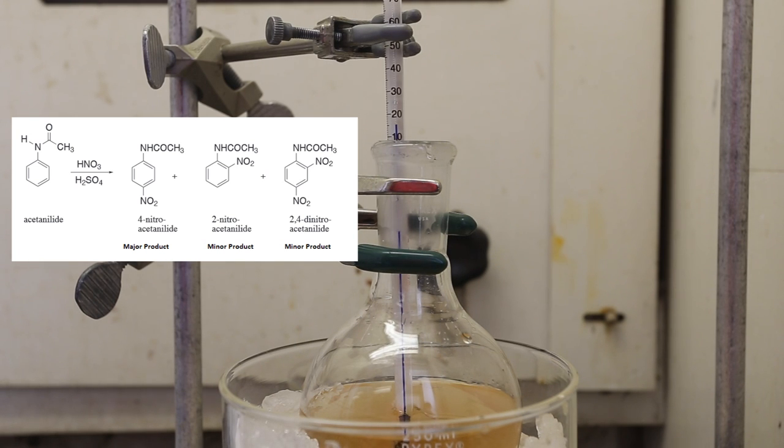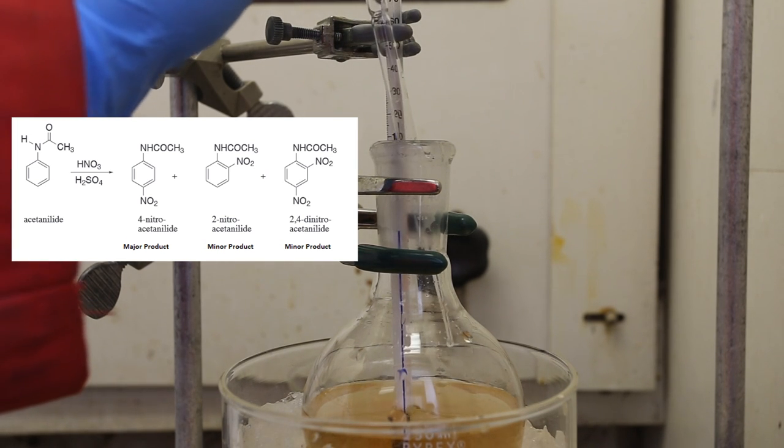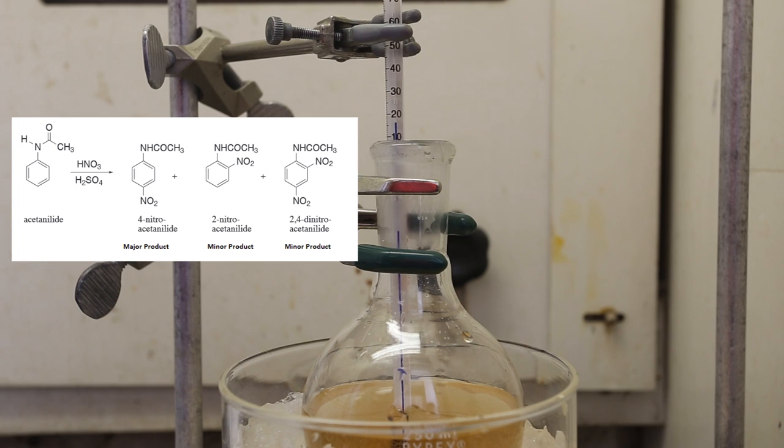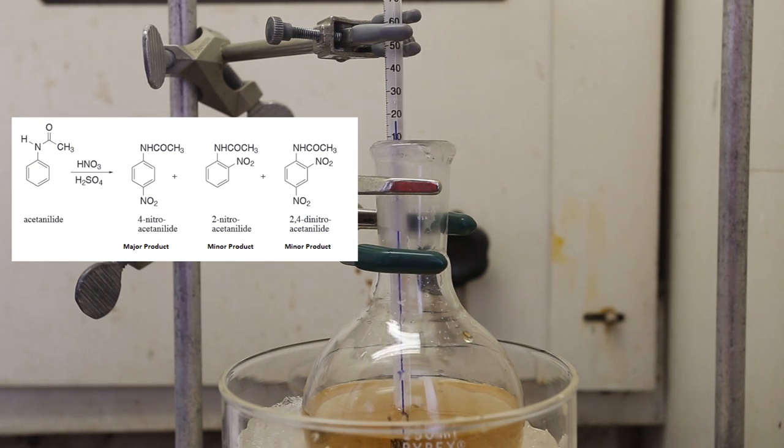Finally, by keeping the reaction temperature low and by adding the nitration mixture slowly, we are able to keep the amount of the minor product, 2,4-dinitroacetanilide, at an extremely low concentration. A recrystallization will be done later to remove as much of the minor product as possible.